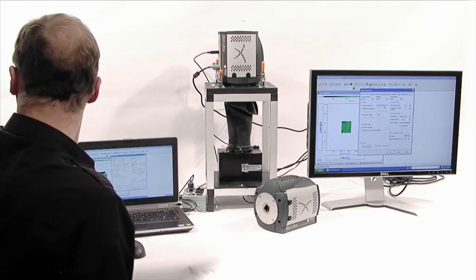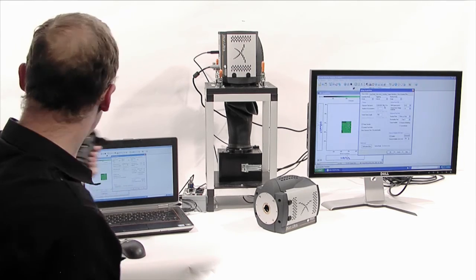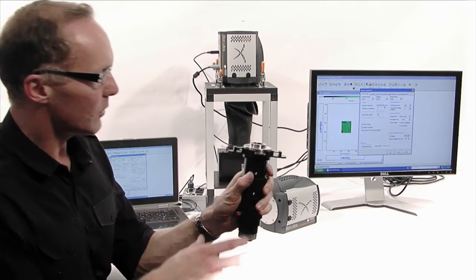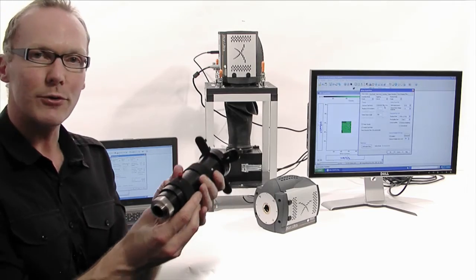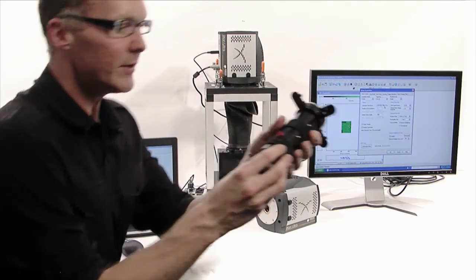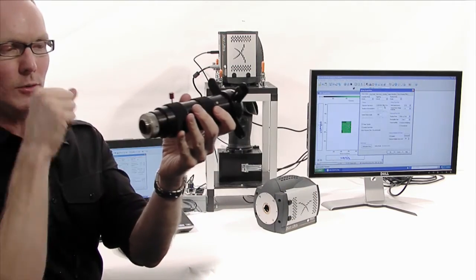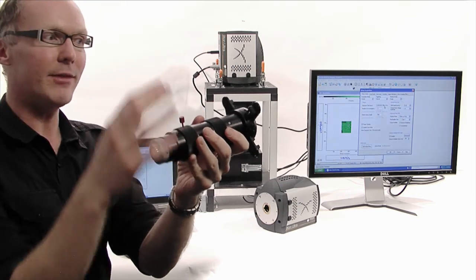Here's one such device which we offer which is called the OptiMask and this is geared towards microscopy in particular. This goes between the output of the microscope and the camera.